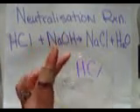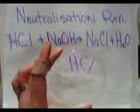So what will happen when we mix these together? We mix these together and you notice that the pink disappears. Now ideally I was hoping I had the same concentration of acid and base, and I do — I've got about 0.1 molar of each. But my pink disappeared, so that means I'm more acidic now than basic.